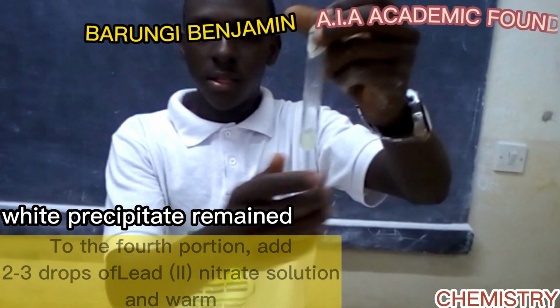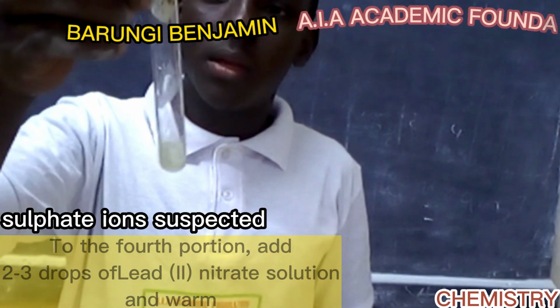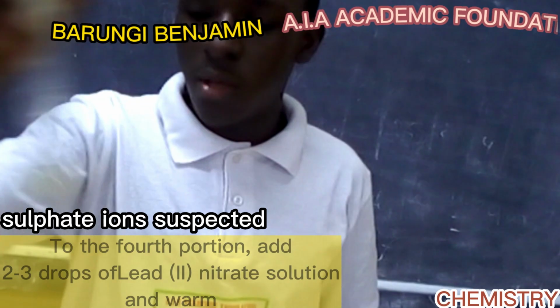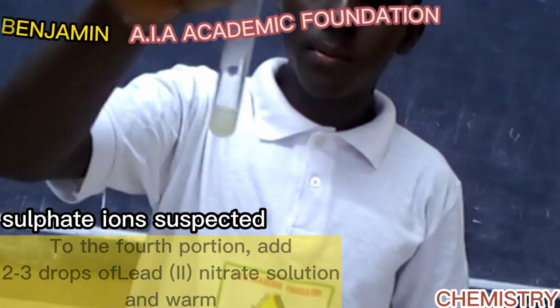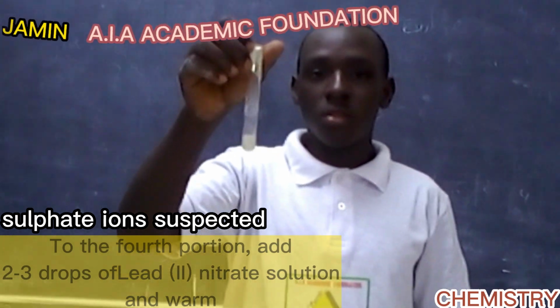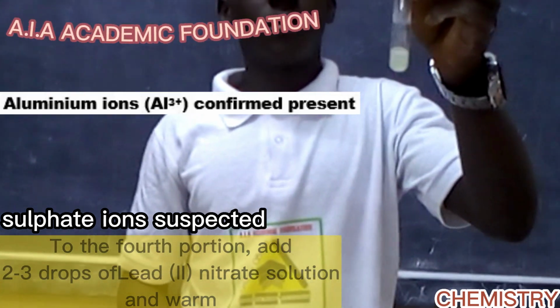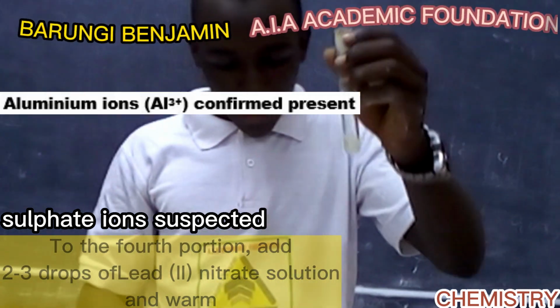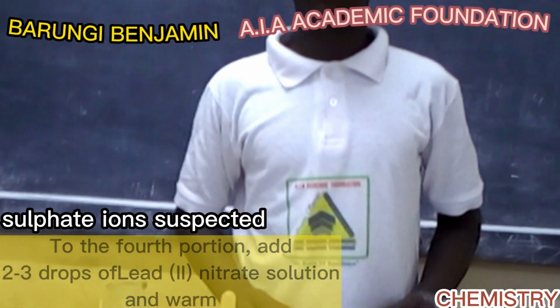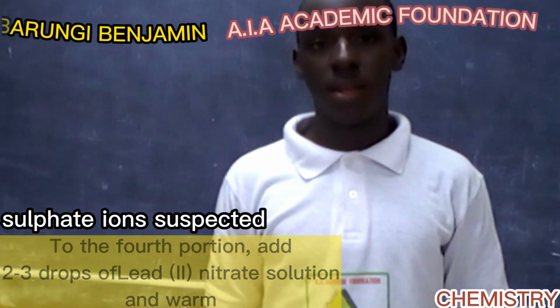This shows us that there could be sulphate ions present in this solution, because sulphate ions form a white precipitate which is insoluble with lead 2 nitrate. So in our deduction you write sulphate ions suspected present. We haven't confirmed yet whether they are present.